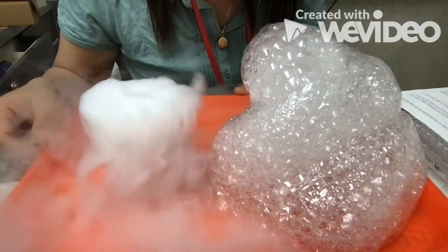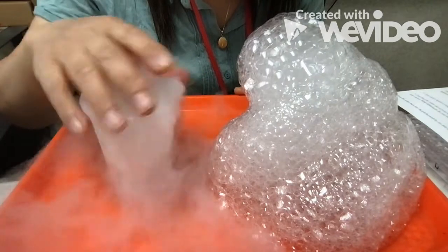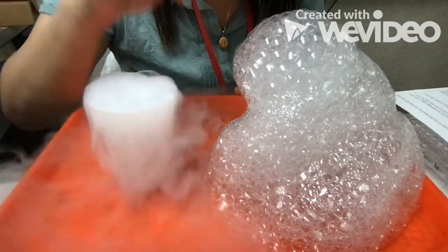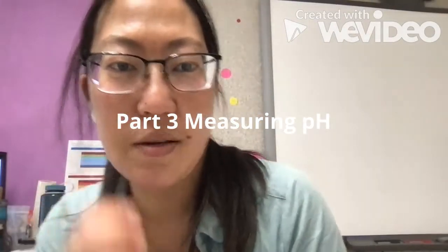So, all right, so that is part 2, dry ice with water. You can see the difference between adding dry ice to cold water versus adding hot water to dry ice. Okay, now we're on part 3.